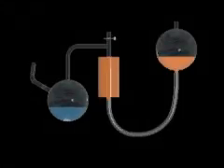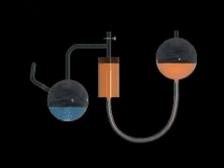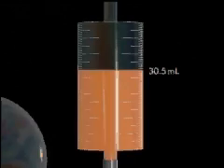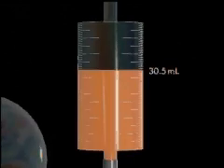Because we have used half of the stoichiometric amount, all of the zinc is consumed in the reaction, and as predicted, the hydrogen gas in the gas burette is 30.5 milliliters, or half the previous amount. In this case, zinc is the limiting reagent.